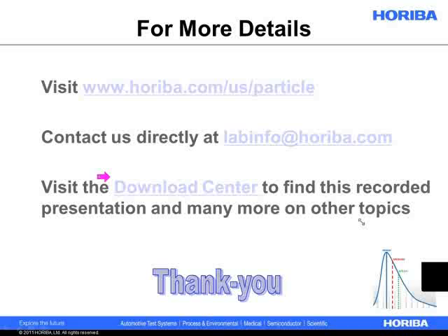And what I mean by that is what the analyzer is actually doing is it's just collecting a scattered light distribution. It's just a pattern, intensity and angle of scattered light. And that information gets passed to an algorithm in the software that takes that information and gets some particle size distribution out of it. Now, there's a few different factors that go into what particle size distribution comes out of that scattered light.